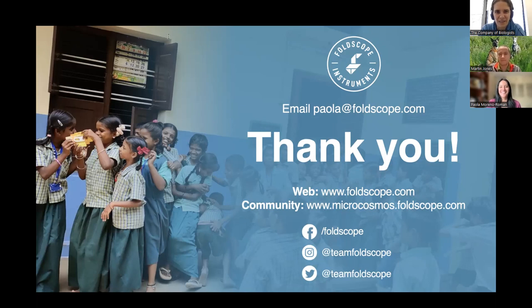I was wondering, do you have a kind of age recommendation for using the Foldscope? Obviously, you're using it with children, but is there kind of a lower limit to that, would you say? Yes, I would say probably 6 or 7 years and older.